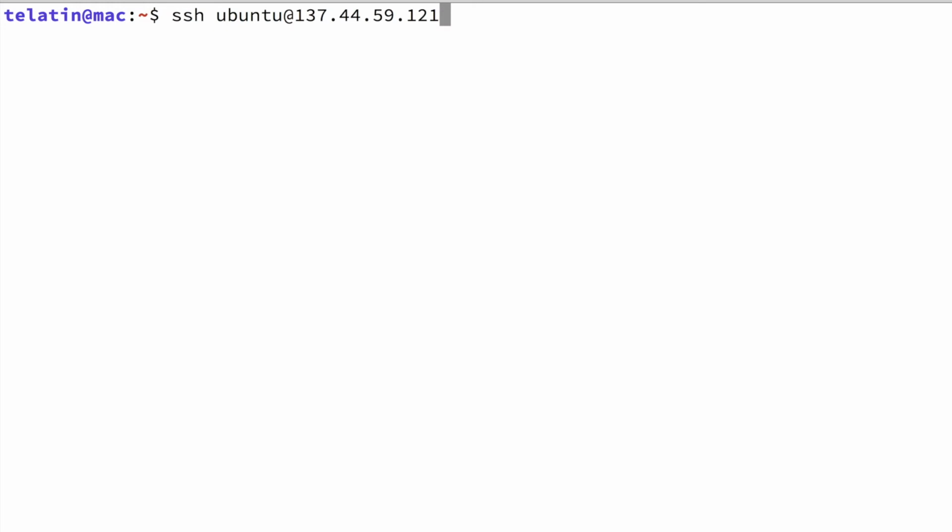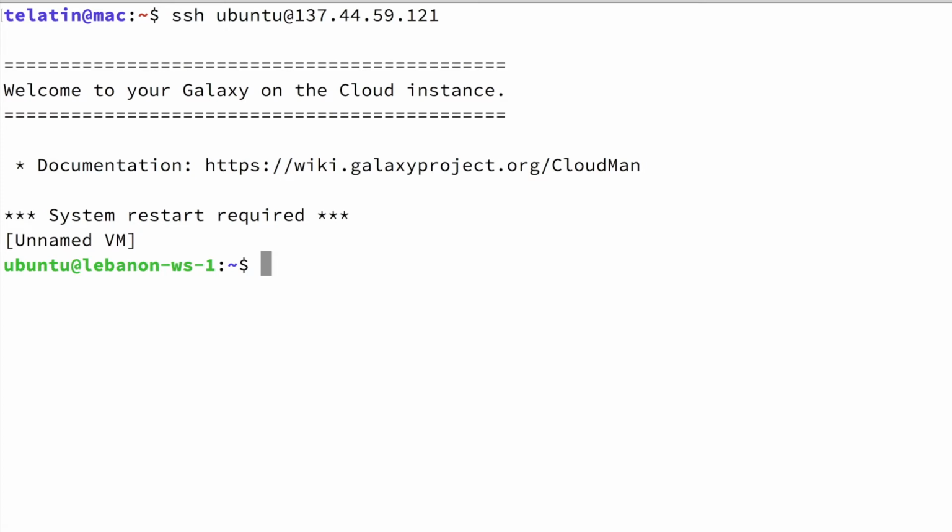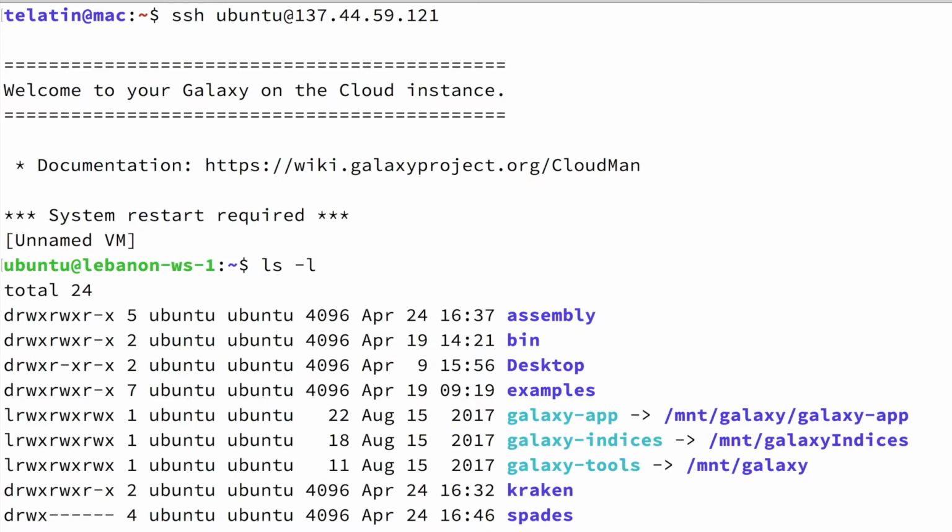So you will see in the website and also now in the screencast how to run the assembly and how to run the annotation. But both processes take a very long time, so there is the pre-calculated output right in our machine. So I log in again.